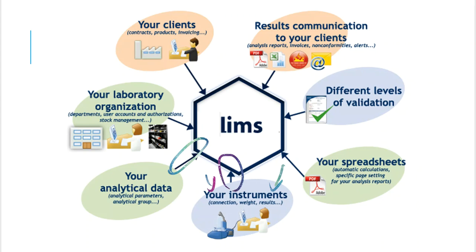So that way an auditor can go back and take a look at this information if needed to see who, when, what, where, how, and what happened. Okay. Also, one of the other things that go into a LIMS system that we might want to talk about right now are the spreadsheets. I know that maybe scares you a little bit.